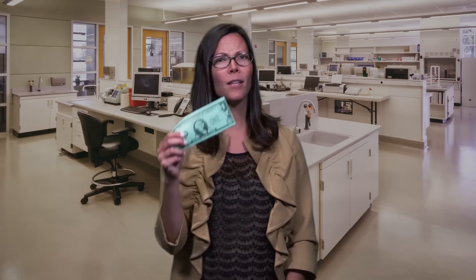When it comes to HPLC purification, the choice of a column is make it or break it. You're more at risk than at analytical scale because you're putting your valuable sample through this purification. And if it doesn't work or something goes wrong, it's like throwing money away. The result can be devastating. You really need something you can trust. So in this episode of Behind the Science, let's look at ways to not sweat HPLC purification.